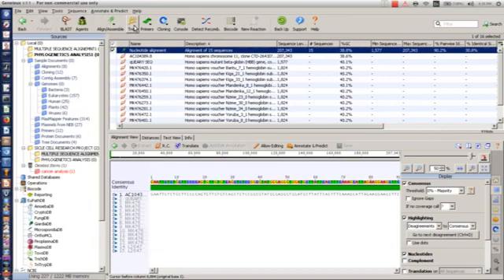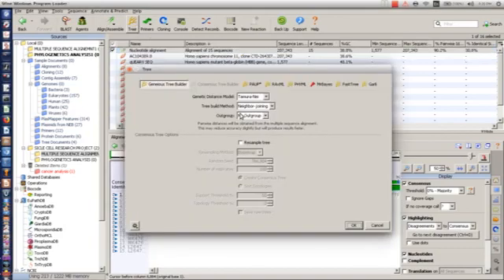So you just click, as you can see, and then we have Geneious tree builder. We have a lot of tree builders, just like alignment tools. So we have tree tools here too. So just use the Geneious tree builder and leave it this way. Neighbor joining, you leave it that way. Then no outgroup. Now choose outgroup. You just have to choose an outgroup.